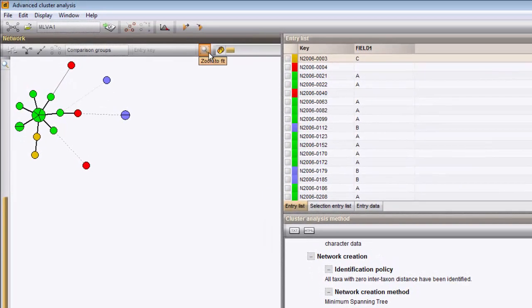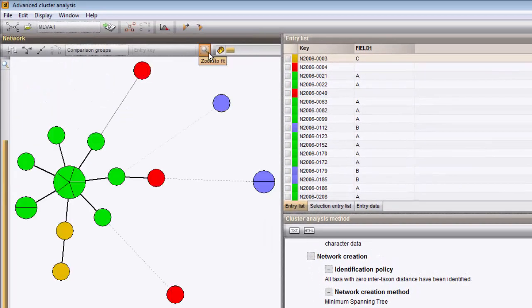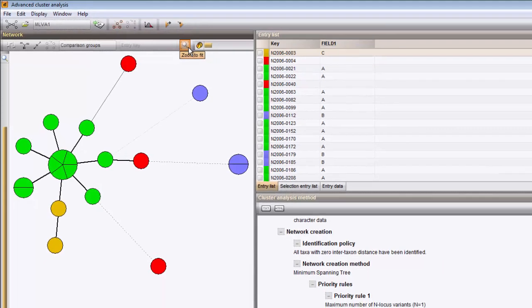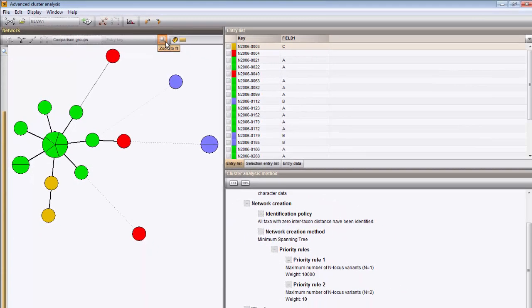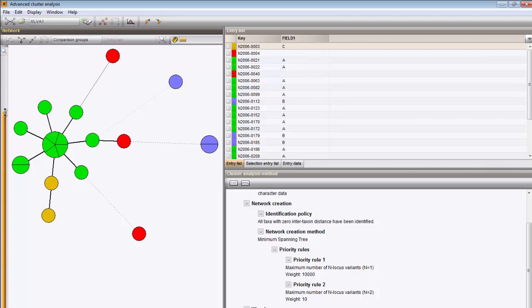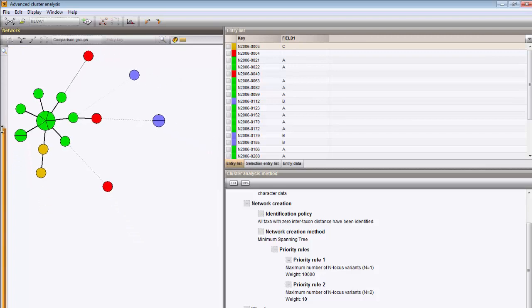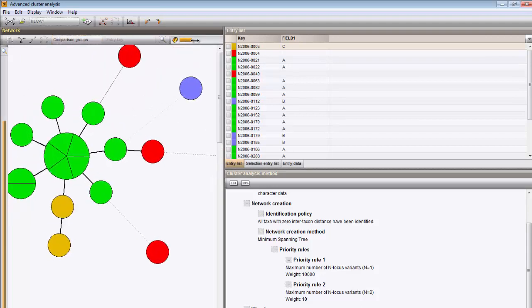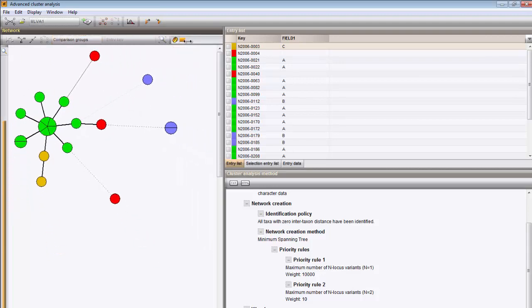The Zoom to Fit button will show the tree optimally scaled in the available window space. The Zoom slider on the left allows further zooming in or out, while the Zoom slider on the top adjusts the size of the nodes.